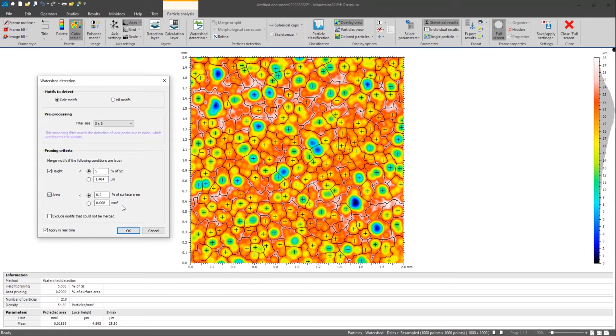From my own experience, I often find that starting by playing with the height settings gives fairly good results rather quickly. Please note that the watershed segmentation is used in other instances of the software. For instance, when one wants to extract the planar contour, or when you want to extract subsurfaces or regions of interest.